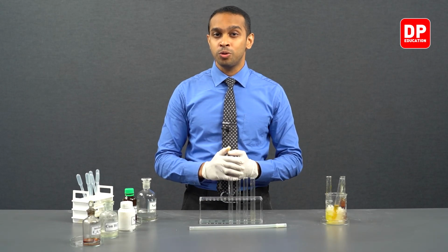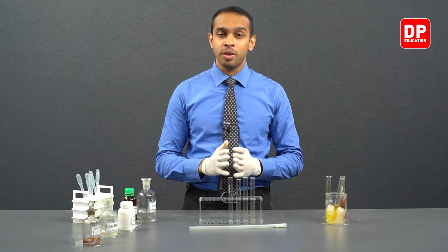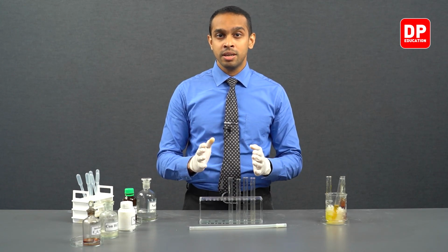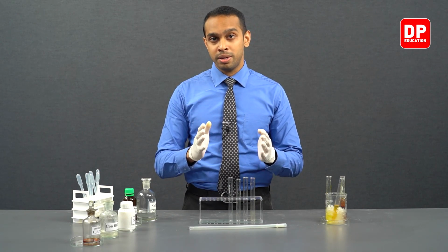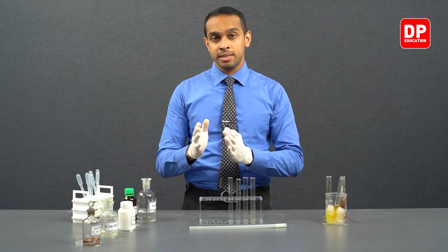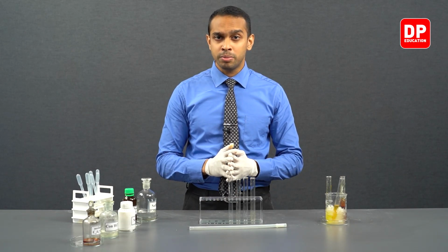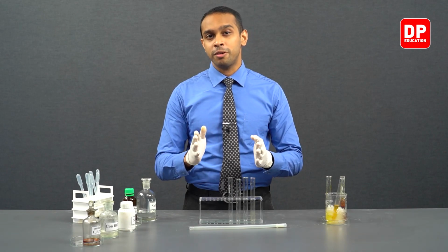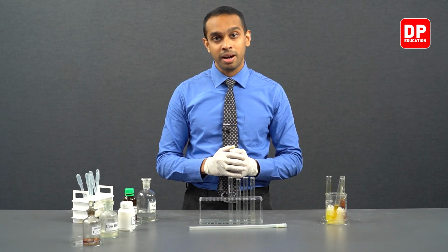Afterwards, we moved on to forming our azo dye. In the first step of forming the azo dye, we had to form our benzene diazonium ion. Benzene diazonium salts are usually unstable. At room temperature, if you carry out this reaction, benzene diazonium salt will not be formed. However, when you mix aniline in the presence of HCl and sodium nitrite, if we carry out this reaction at lower temperatures, we saw that we are forming benzene diazonium chloride, which is our diazonium ion.